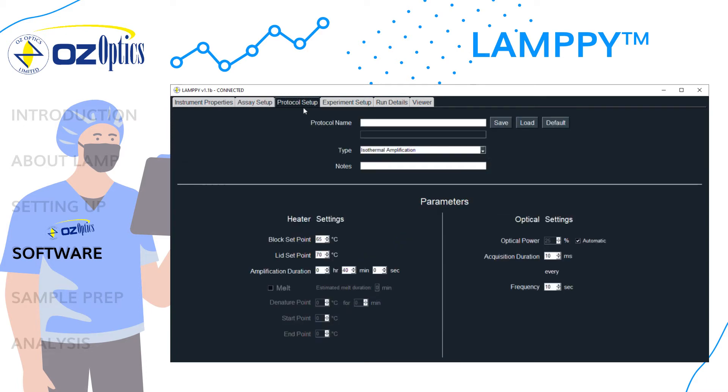On the protocol setup tab, you can input information about the protocol and change settings to suit the experiment. Default settings are isothermal amplification, block temperature set to 65 degrees Celsius, lid temperature set to 70 degrees Celsius, and an amplification duration of 40 minutes. Melt is by default disabled, but can be enabled if melt analysis is desired. For optical settings, the optical power level will be automatically applied by default, making getting the best signal to noise ratio easy. Acquisition duration is set to 10 milliseconds every 10 seconds. Protocol settings can be saved and loaded for faster setup.